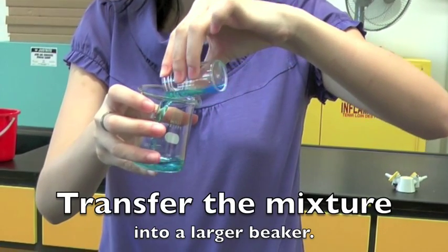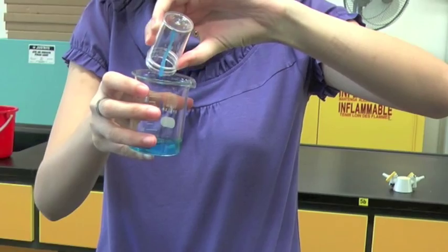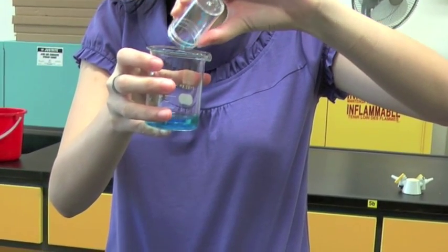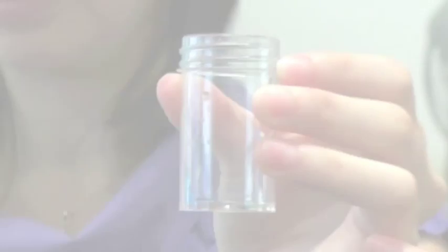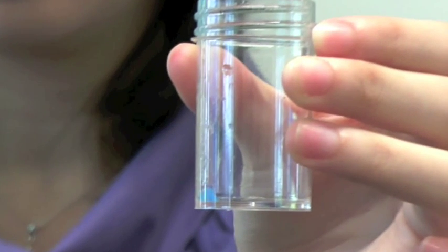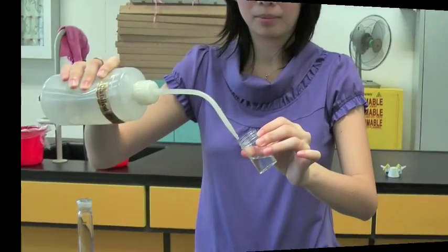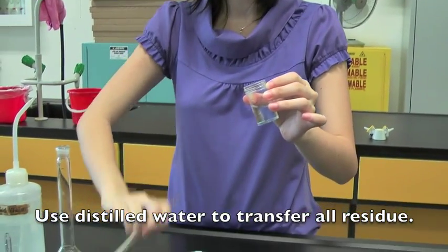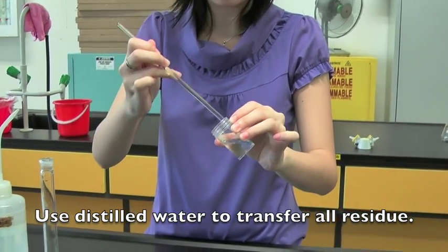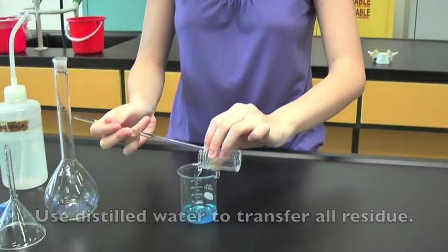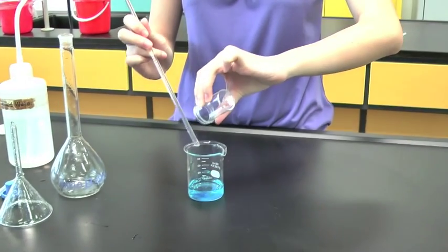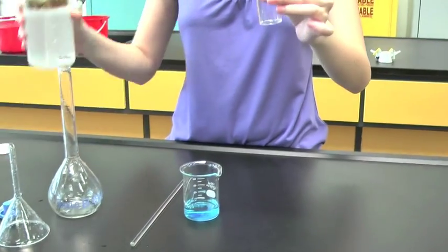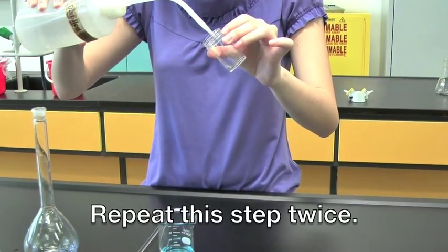Transfer the mixture into a larger beaker. You will find that there is still a small amount of residue left in the bottle. Use distilled water to transfer all residue into the beaker. Repeat this step twice.